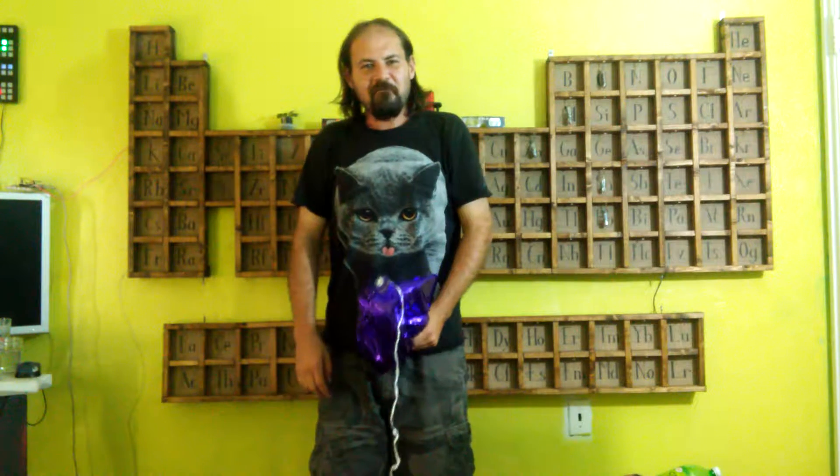Hello Internet, Zach here, and welcome back to Collecting the Elements. In this episode, I'll show you my failed attempt to get helium into a spectrum tube. It's gonna be interesting. There's some amateur glass blowing, there's some messing around with the vacuum rig, there's an epic fail at the end.